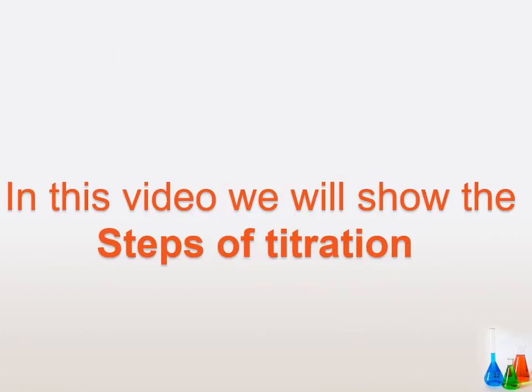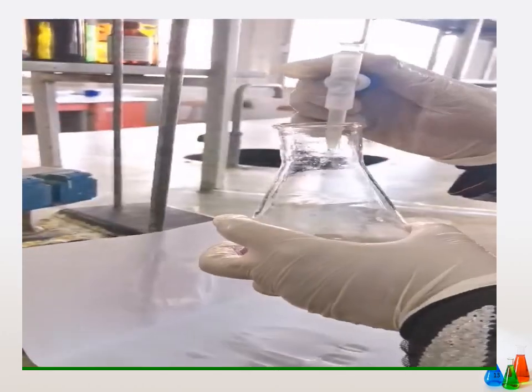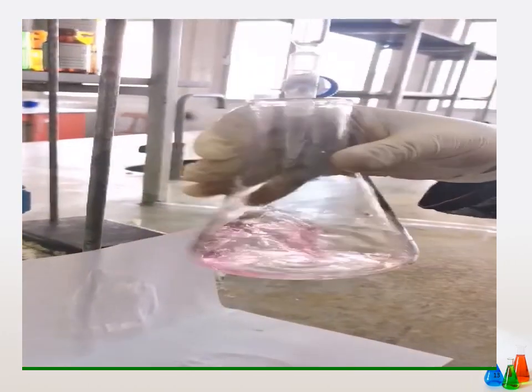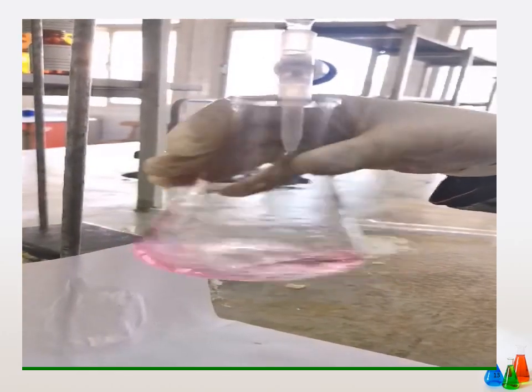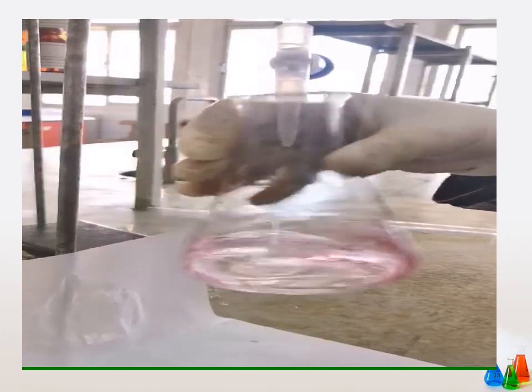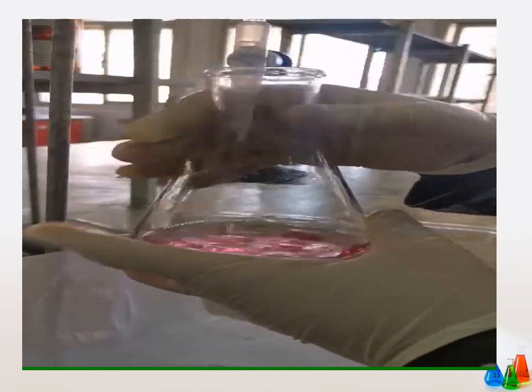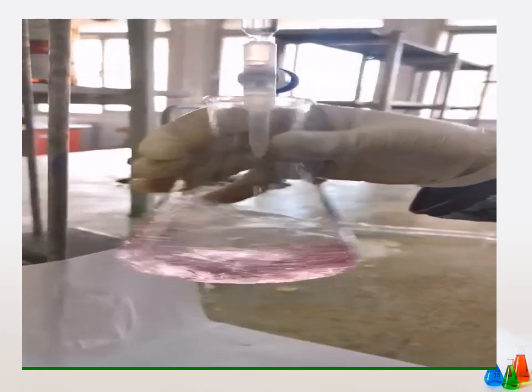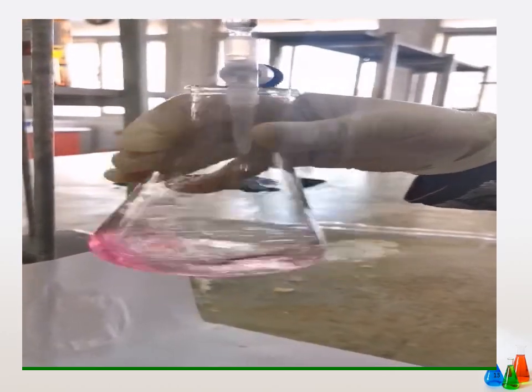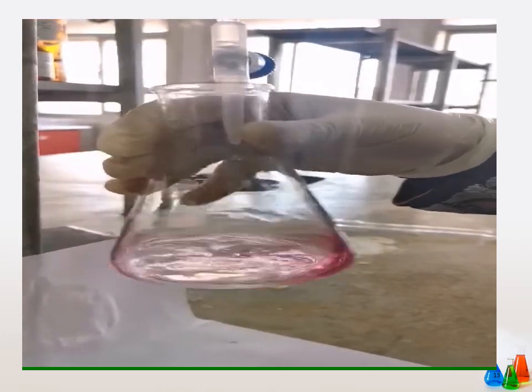In this video, we will show the steps of the titration. As shown in this video, titration will begin by opening the burette and shaking well after each addition from the titrant to the analyte in the flask. Titration will continue until the pink shade changes to a sky blue color. The first change to the blue color is the end point. When we reach this blue color, we will stop the burette immediately and then take the end point.